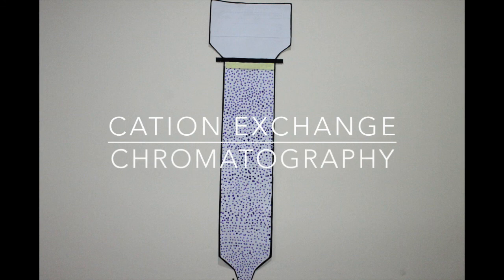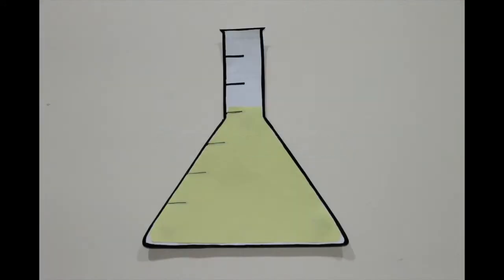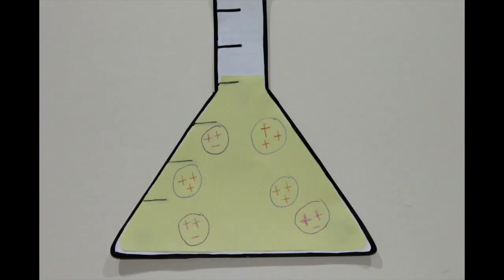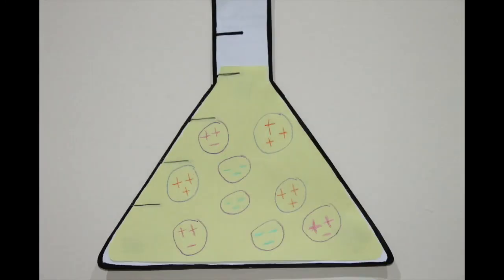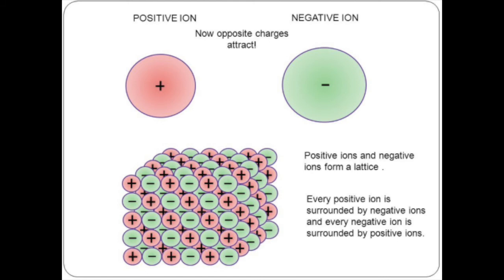The second step is cation exchange chromatography. The setup consists of a funnel placed on top of a narrow column. The column is packed with charged gel beads. Here, we use negatively charged beads, since IgY has a positive net charge. In the supernatant, we have water-soluble proteins, which contain very positively charged protein, slightly positive protein, and negative protein. As the supernatant moves down the column, those proteins with the greatest net positive charge will move slowest down the column because they will be attracted to the negative beads.